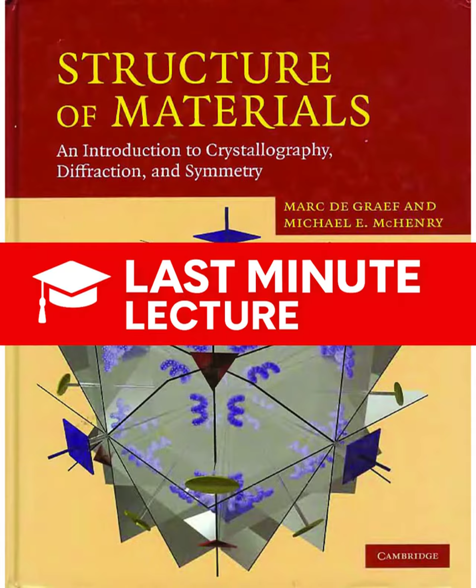Exactly. The mission today is to give you a fast but thorough understanding of the principles that govern how radiation interacts with ordered matter, culminating in the foundational laboratory techniques. Okay, so we're going to cover where X-rays come from, derive the fundamental law of diffraction, visualize this geometry using a brilliant conceptual tool called the Ewald sphere, which is a lifesaver for getting your head around this stuff, and then walk through the mechanics of the experiments you see in every materials lab, the powder and Laue methods.